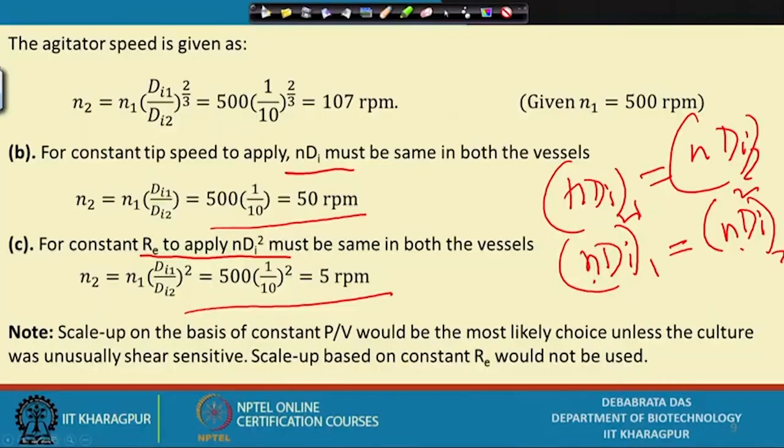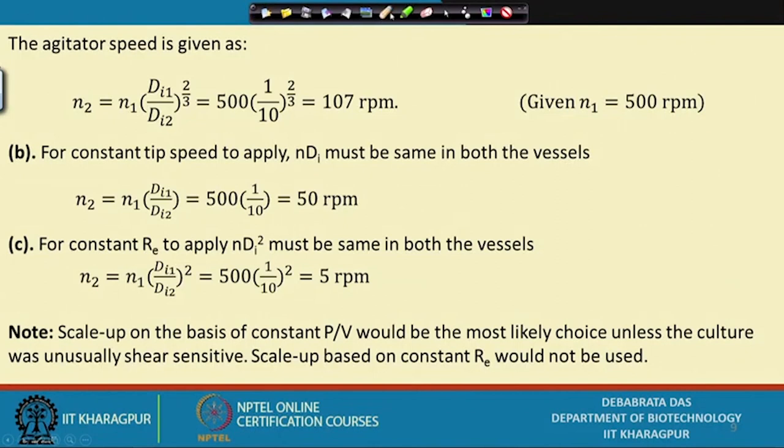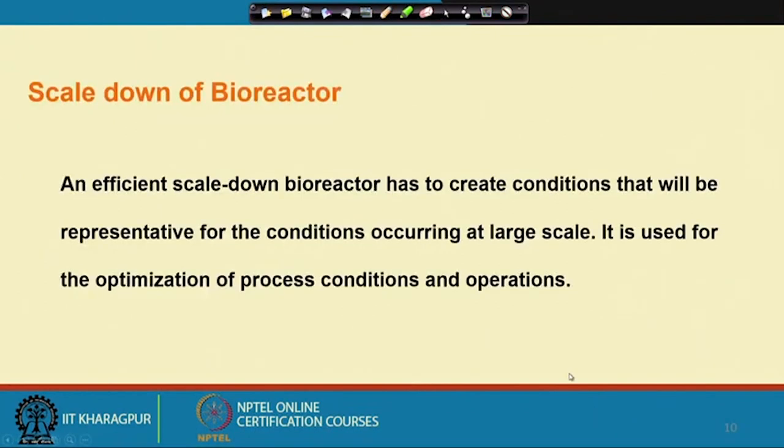Now, the next thing that I am going to discuss is scale down of bioreactor. Up till now, we have been discussing the scale up of bioreactor. Now, the question comes, why is the scale down of bioreactor required? Because it is very simple.